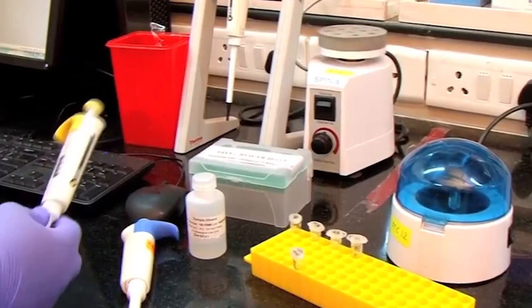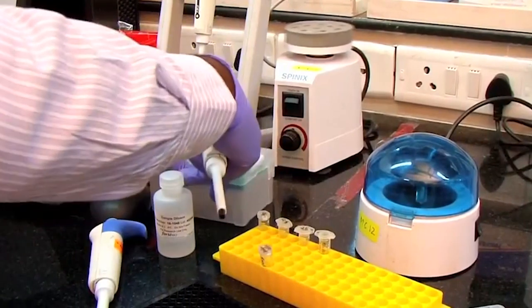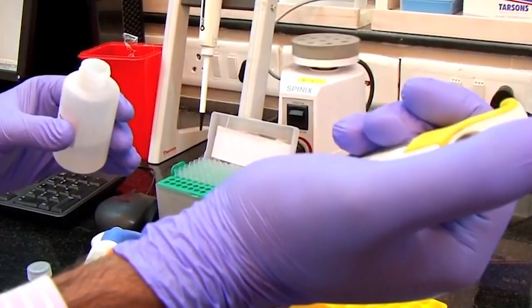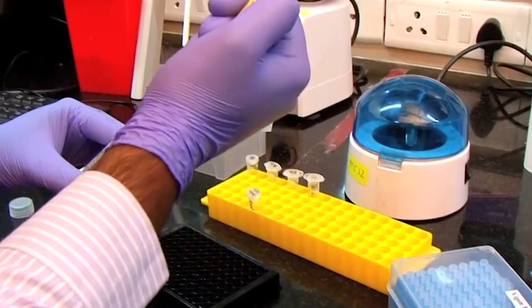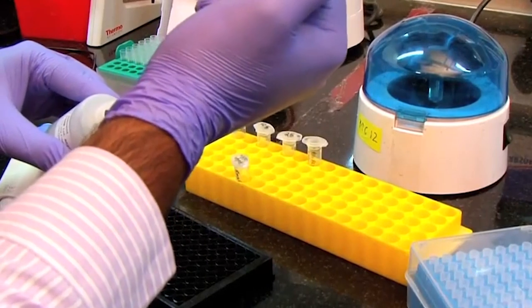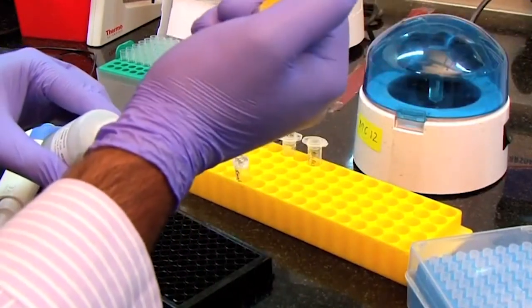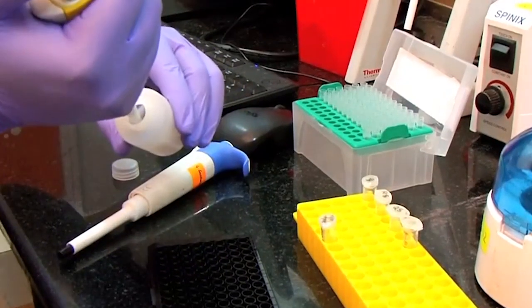Here I'm taking this 96 well plate and adding the buffer into the wells. I'm going to use around 6 concentrations, with 2-fold dilutions. I'm going to do the dilution in the plate itself. So I'm placing 200 microliters each of the sample diluent buffer in 6 wells of the 96 well plate. And I'm going to use 3 wells as references. This plain buffer is used as a reference.